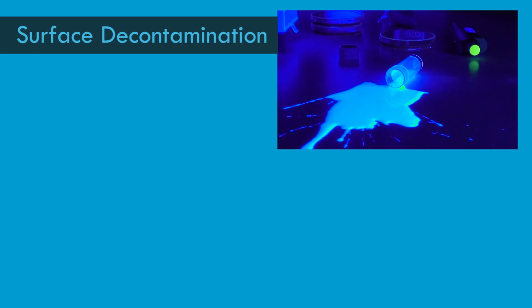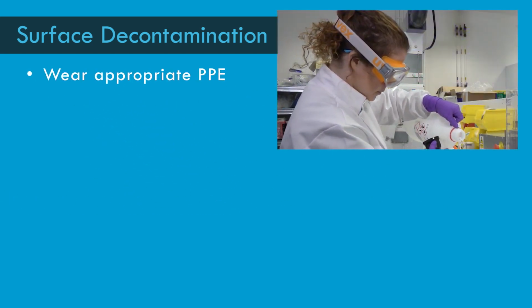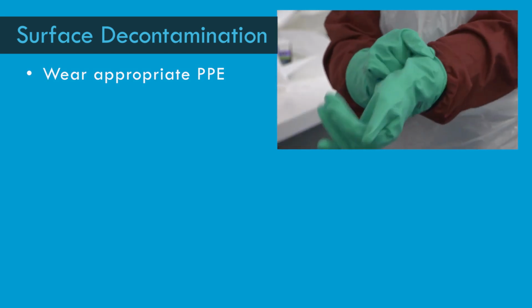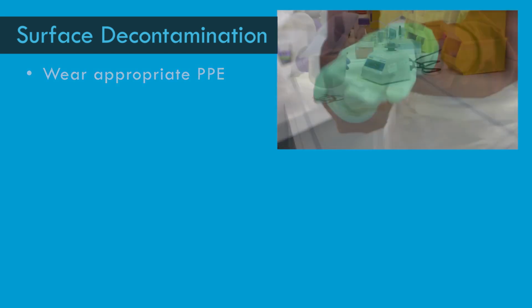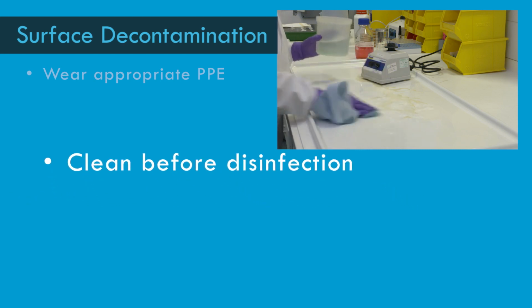In summary, effective surface decontamination practices must include wearing appropriate PPE, that protects against the biological agents and the disinfectant chemicals. Where necessary, clean surfaces before disinfection.